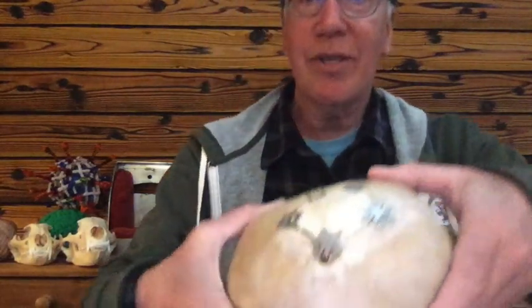In order to identify where you're going to be drilling and then delivering the cannula or the electrode into the brain, for rodent surgeries, rodent stereotaxis, they typically consult a rodent brain atlas. So there's an atlas of your standard rodent, and it'll give you coordinates. And this is not a rodent, this is a human skull, but I wanted to show you some of the features here.